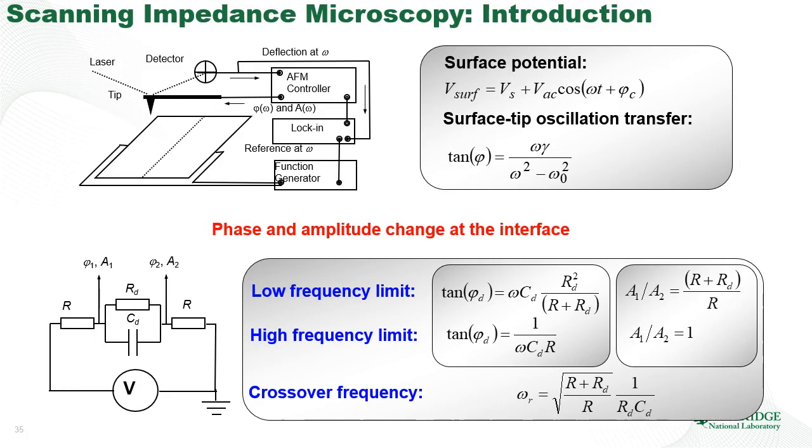Now, what about the frequency domain? Both the KPFM of the laterally biased devices and the time-resolved KPFM explore the relaxation of the surface potential measured in the time domain. In the KPFM, we do it first as a function of position and then as a function of time. So our time-resolved measurements are slow. They're limited by the speed of the position-resolved measurements. In the TRKPFM, we basically implement the time-resolved measurement at each point using essentially the pump probe.